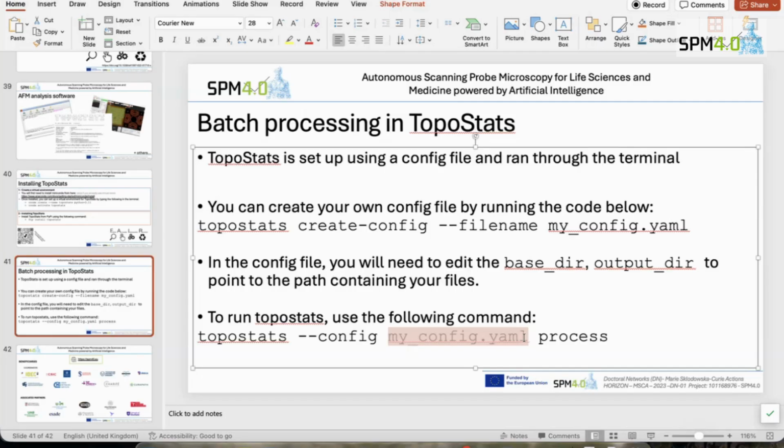That's got very extensive. And it's not the name of the lifestyle. Yeah, I was able to get the. And playing around with the parameters to get different masking and things like that. Still learning.